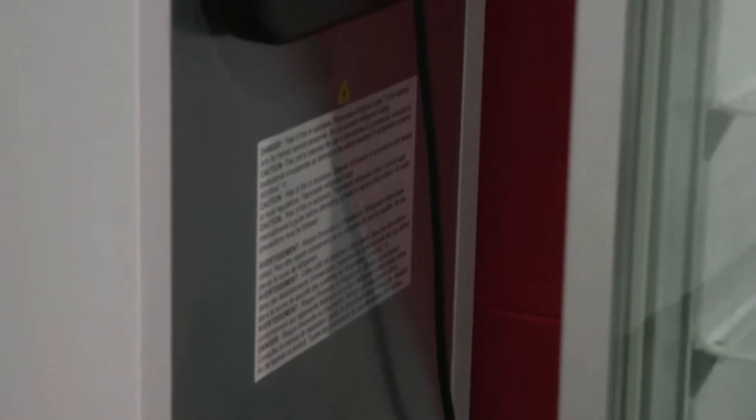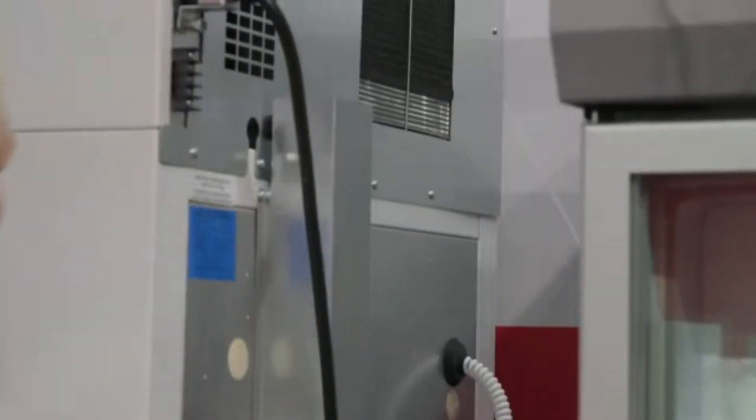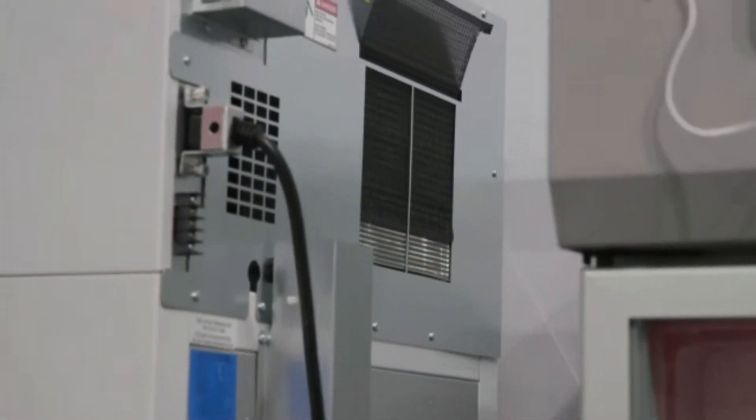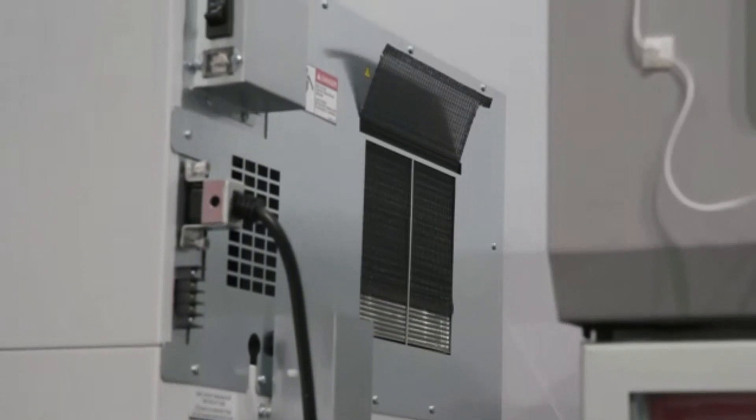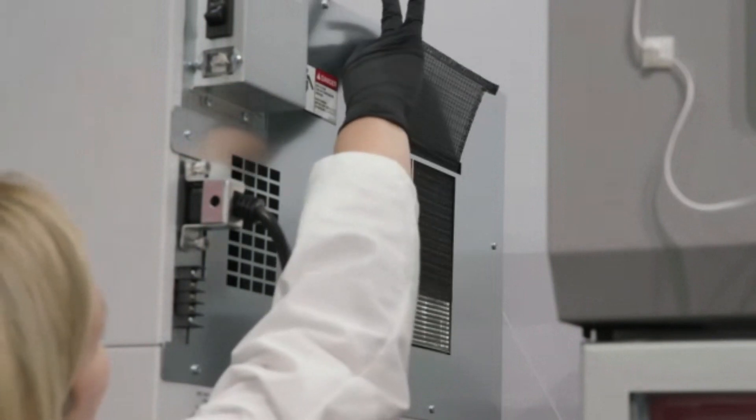There's the port in the back of the unit — that's where you want to run the sensor through on those units. The condenser filter protects the condenser and it's located on the back of the unit at the top right side. You can see it's partially pulled out — that's how you pull it out to clean it and then replace it afterwards.